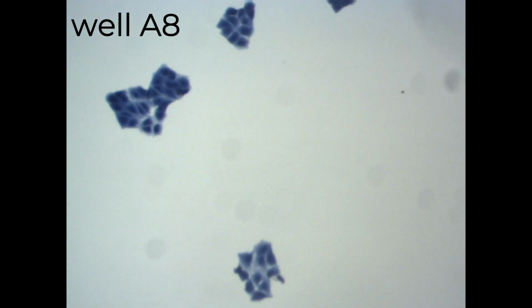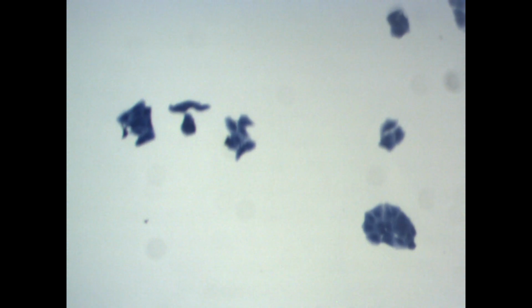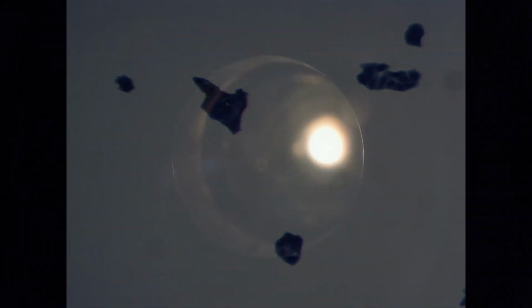Okay, we ended up in well A8, and there I think the colonies are much more compact, but make sure that you observe most of them. Move around through the well because you see different regions and different cells behaving in different ways, but clearly a very compact phenotype. So I would call that maybe a negative.